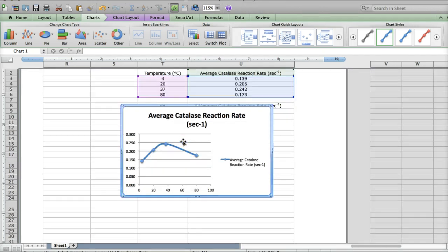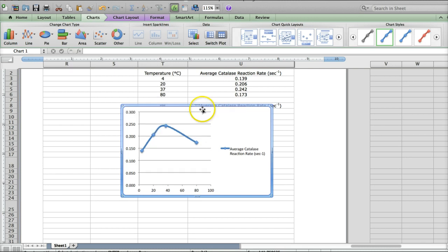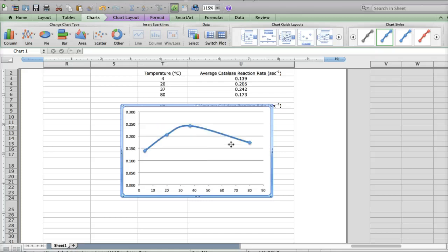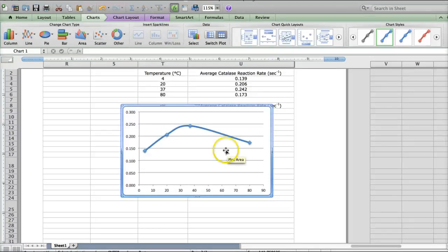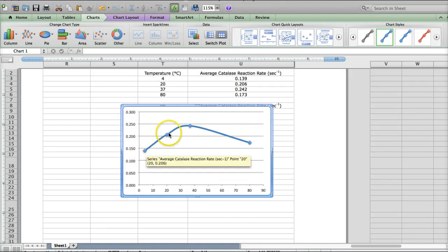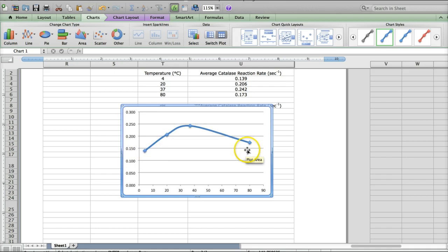Mine automatically includes a title. For this, we're going to add the title in the Word document, so we don't need that. Mine also includes this legend automatically. But since we only have one set of data, we're only looking at catalase enzyme, we don't need that either. And what we're left with is this really nice scatterplot of your averages connected by a smooth line.